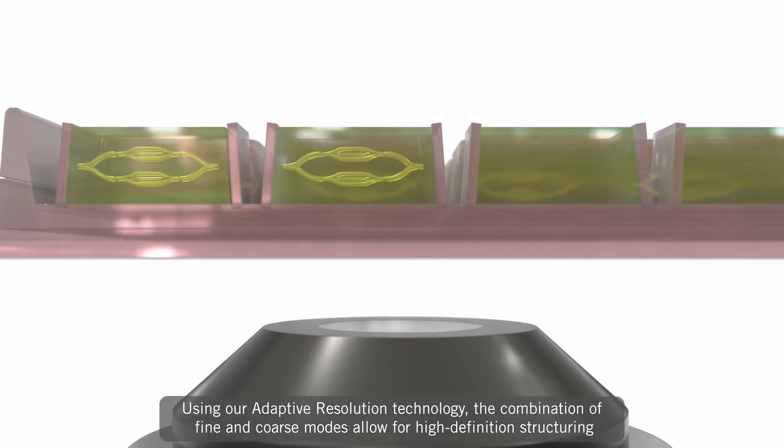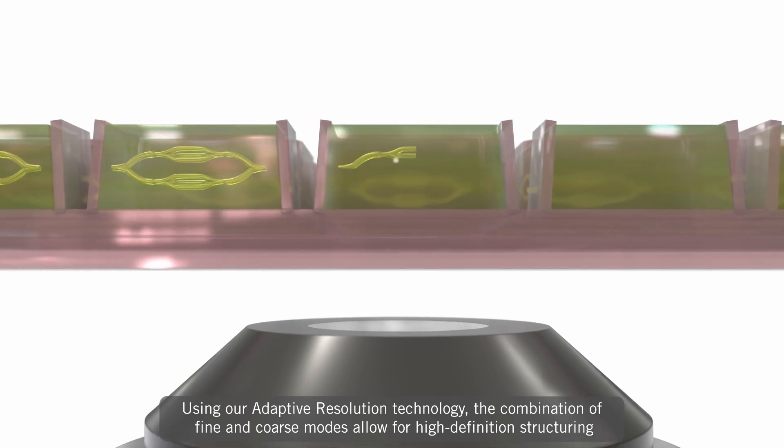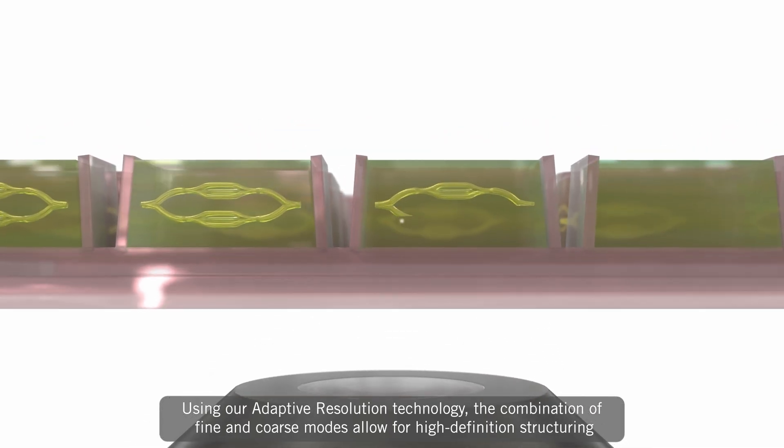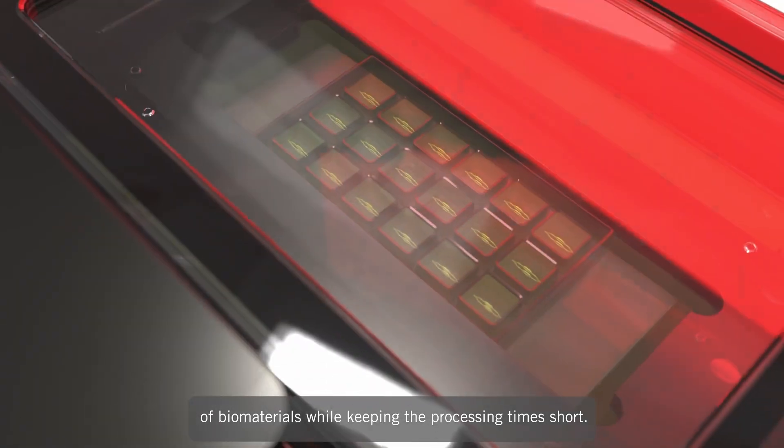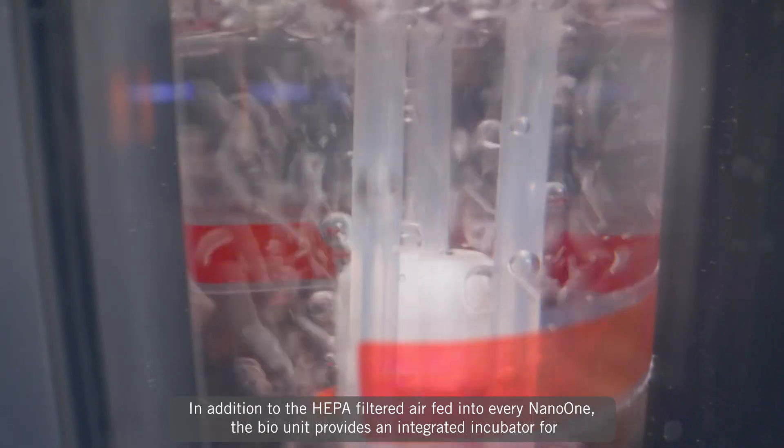Using our adaptive resolution technology, the combination of fine and coarse modes allows for high-definition structuring of biomaterials while keeping processing times short.